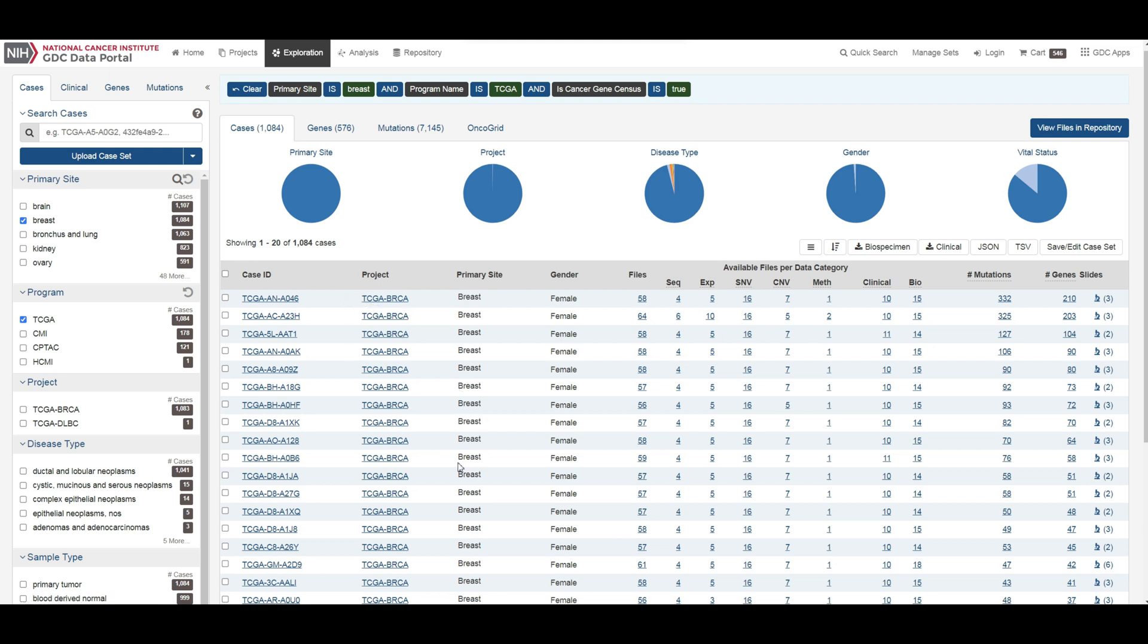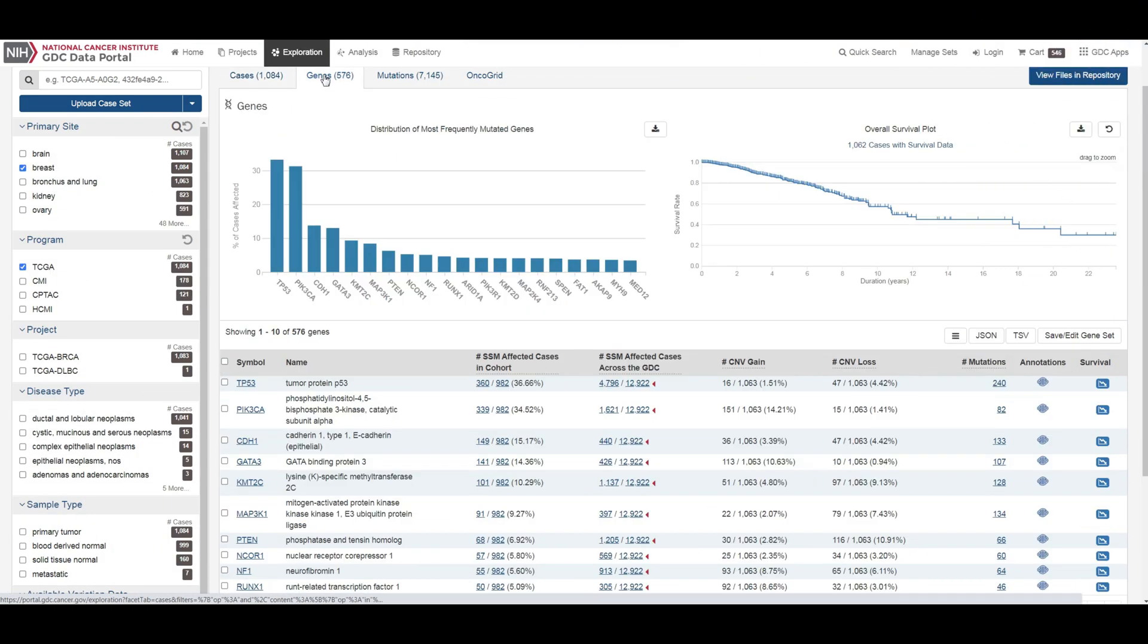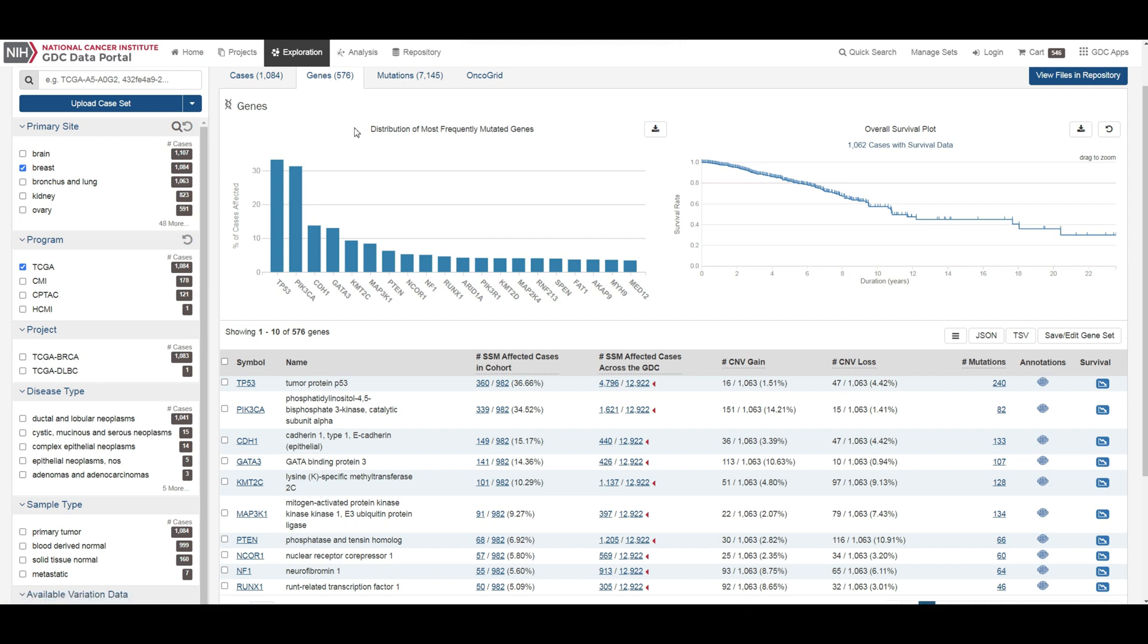The genes tab will give an overview of all the genes that match the criteria of the filters. The top of this tab contains a bar graph of the most frequently mutated genes.